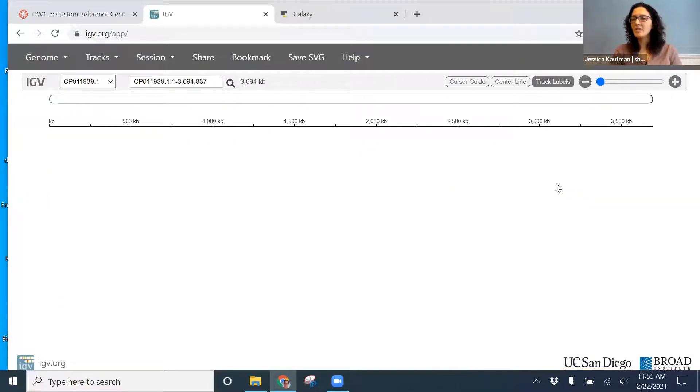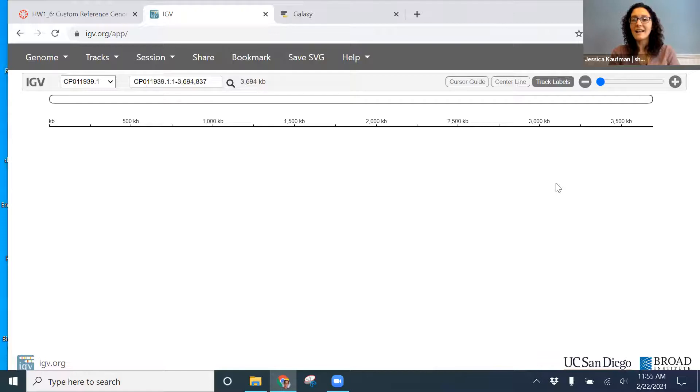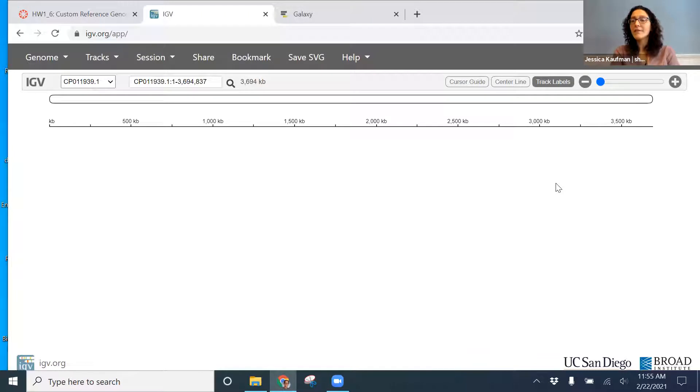And this should look really familiar. This is what you submitted for homework 1-6. It is a SLAC strain of the Bacillus coagulans genome, the reference genome that we've used for the Unit 1 project.